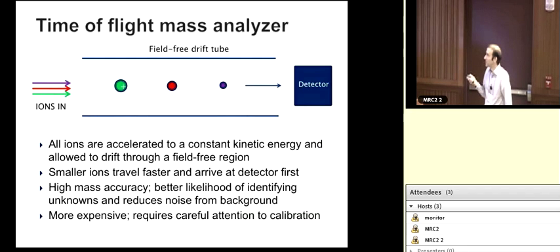So all of these things can cause ion suppression. It can vary from sample to sample. That's a challenge. If your matrices are different from sample to sample, you might have differential ion suppression. It could vary from run to run, day to day. Thus, it can cause problems with quantitation. So, oh no, why are we doing mass spec?